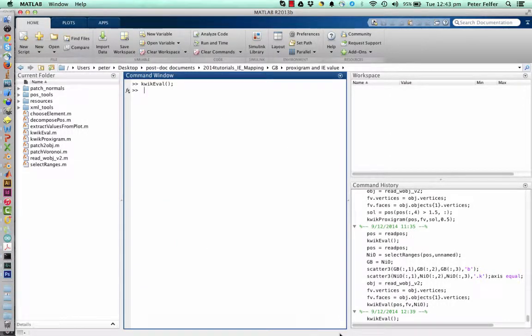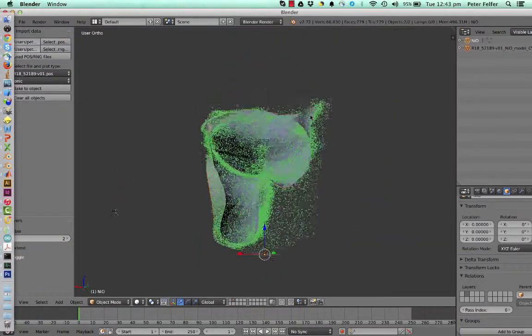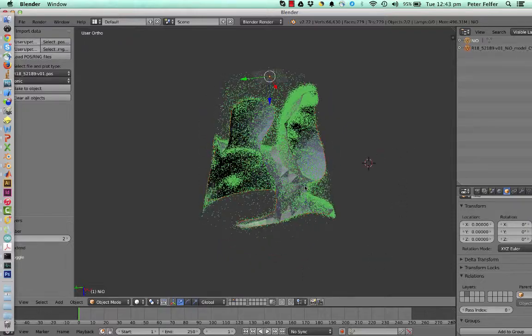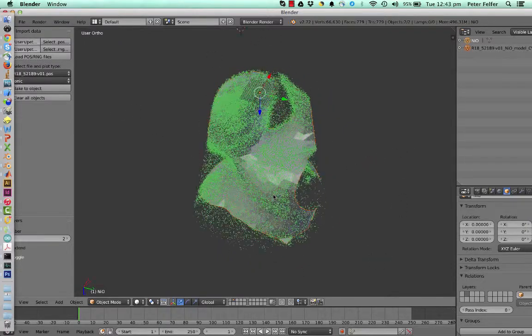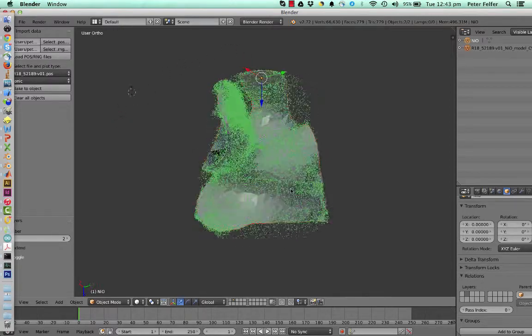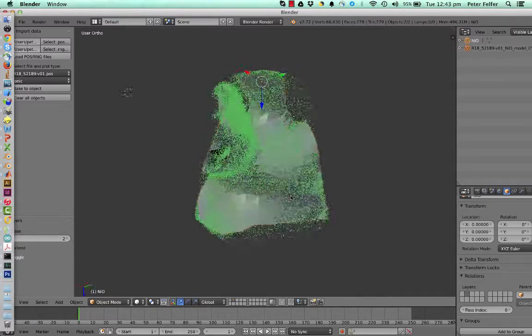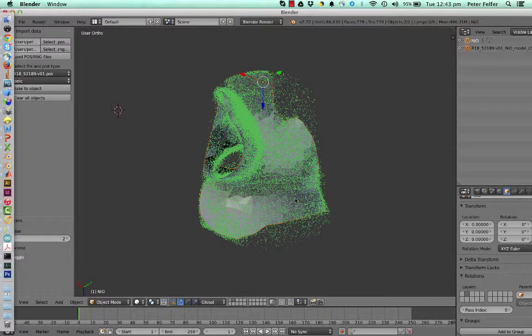So now I'm going to show you how to do everything in command line in MATLAB, and we'll do it now for the more complex situation here. We've got the segregation of nickel oxide to an interface. Again, this interface is a little bit more complicated to create, but don't worry, it's not super bad. It took me, I think, half an hour to create the whole thing.